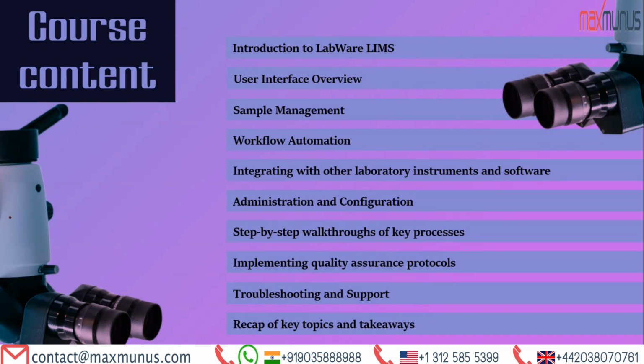Introduction to Labware LIMS. User interface overview. Sample management. Workflow automation. Integrating with other laboratory instruments and software. Administration and configuration.